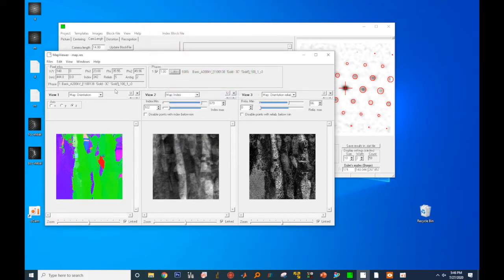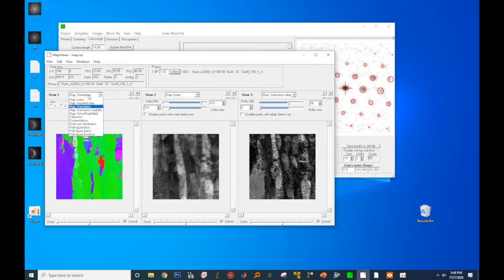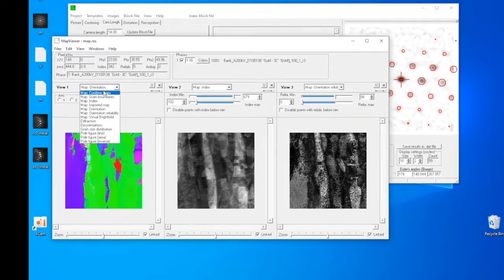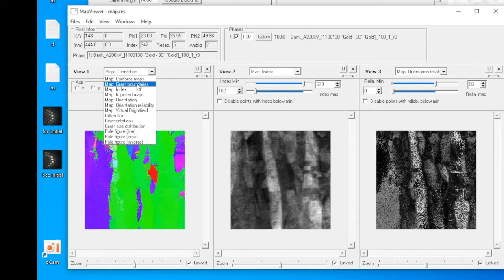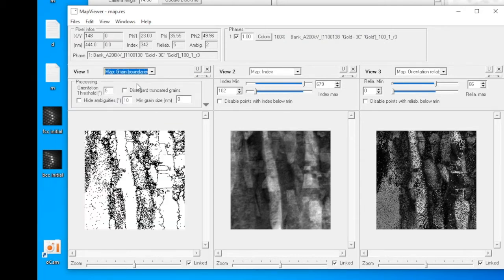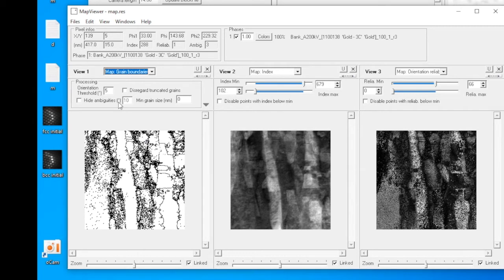With the NanoMegas PED system, you can do a lot more than orientation mapping. Click on the drop-down menu. You will have a lot of options to choose from. We'll look at the combined maps later, but select the grain boundaries. Now you see the grain boundary map. You can decide the orientation threshold, minimum grain size, and whether you hide the ambiguity.